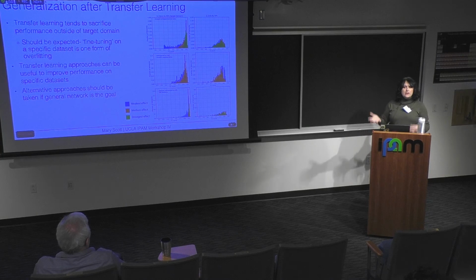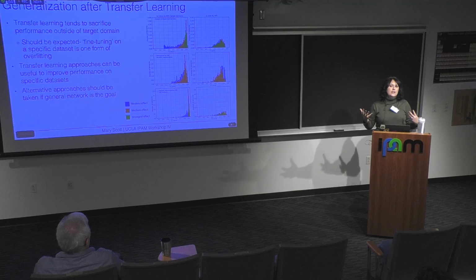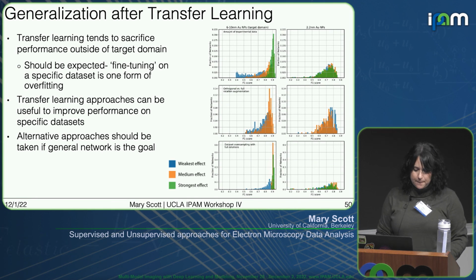And we see some takeaways that I think are similar to what anyone who's studying transfer learning would see, which is that you get performance boosts the more you transfer learn, but you then in a way are overfitting to that data set that you're learning from, that experimental data set. So you're sort of zooming in and trading, I would say, generalizability for performance within that specific domain. So depending on your application, maybe those are some choices that you have to make.